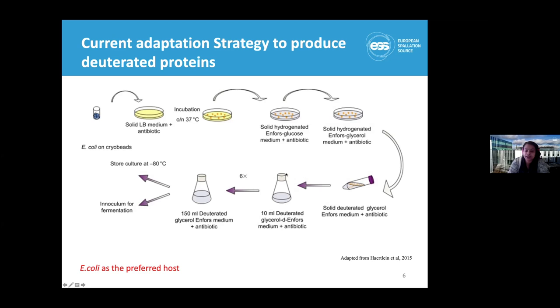We continuously repeat this process at least six times, so that the growth rate of the bacteria is increased in the deuterium media. Finally, we re-inoculate this culture in a 150 ml deuterium media, which is used as a starter culture for higher density culture or the large culture.